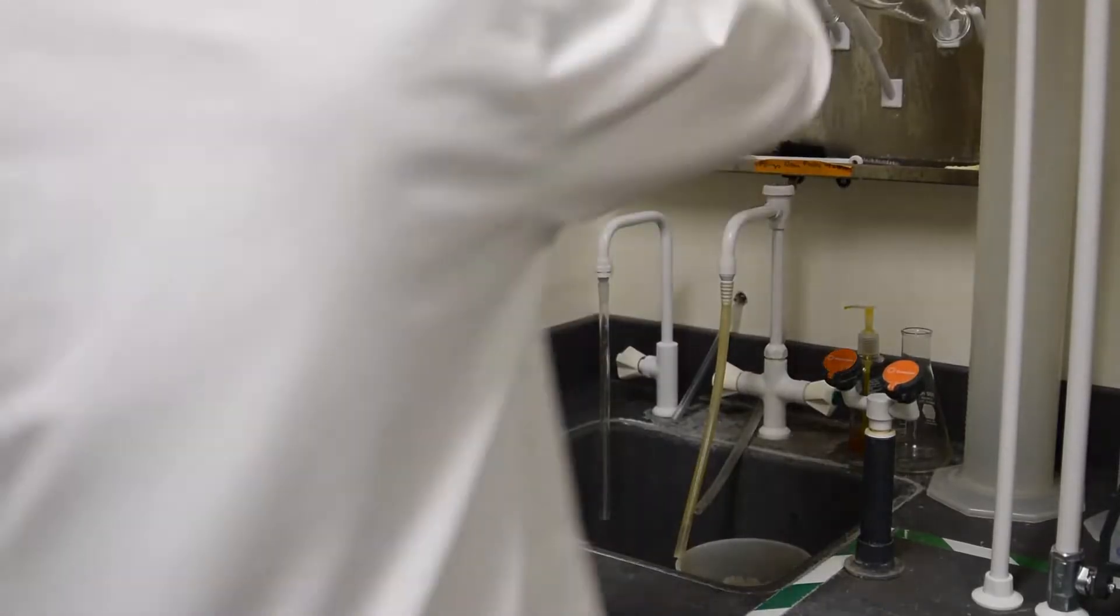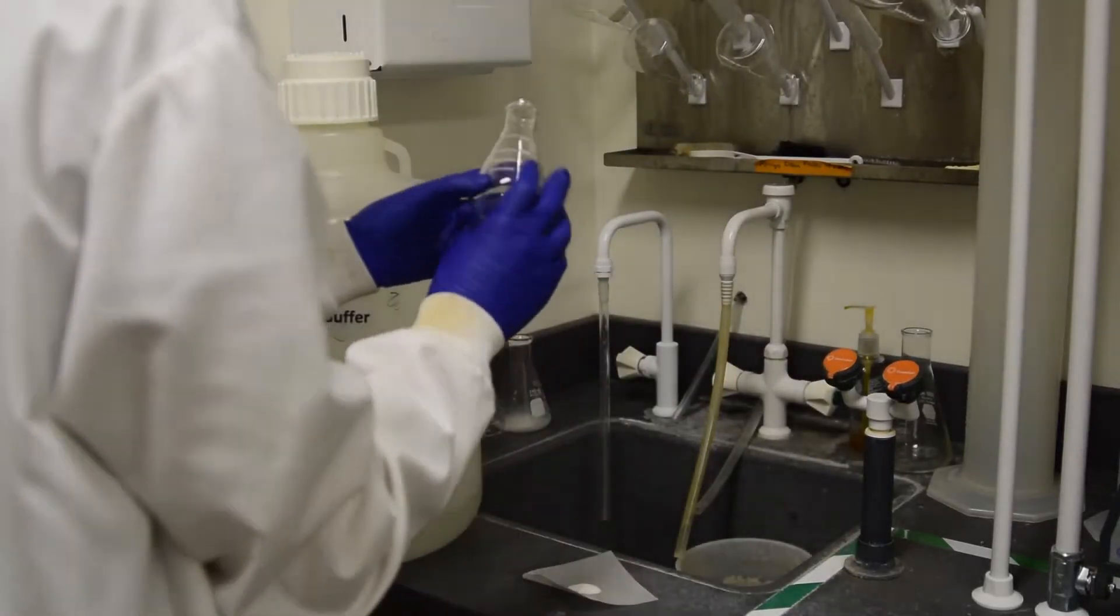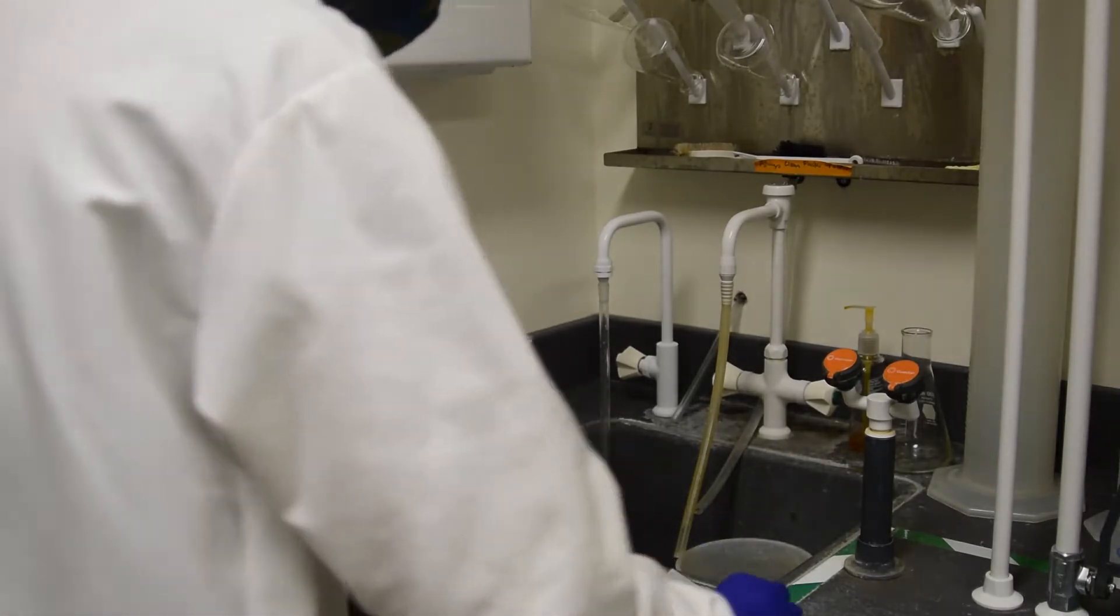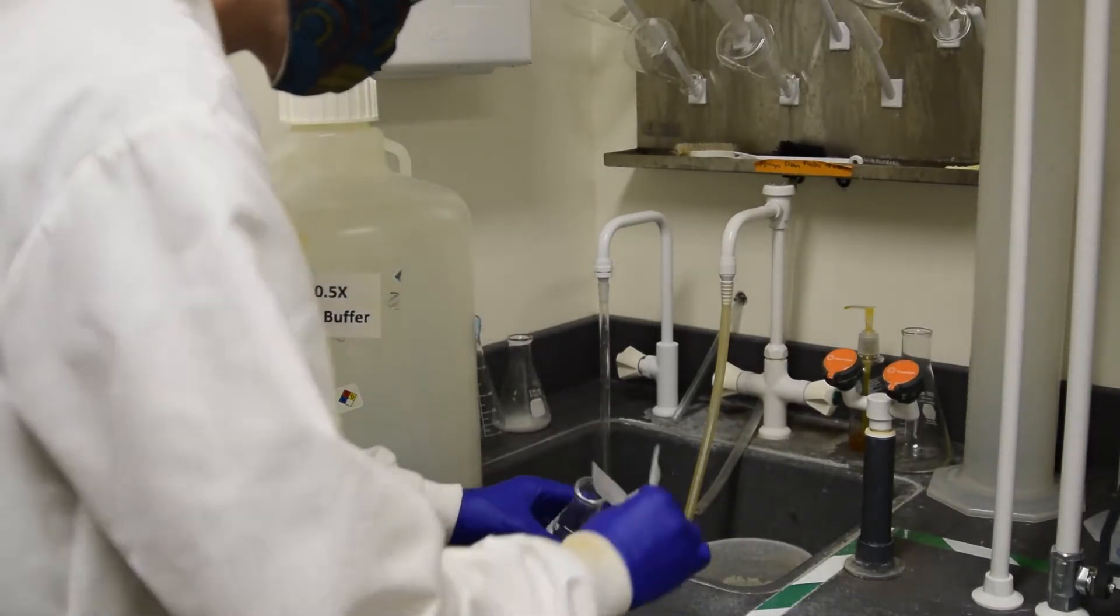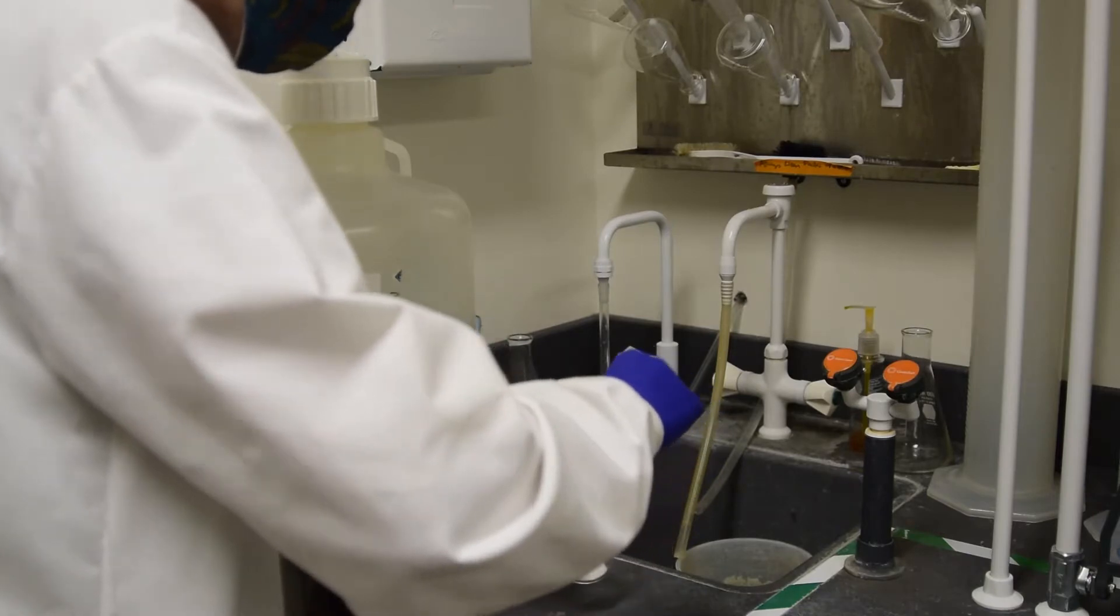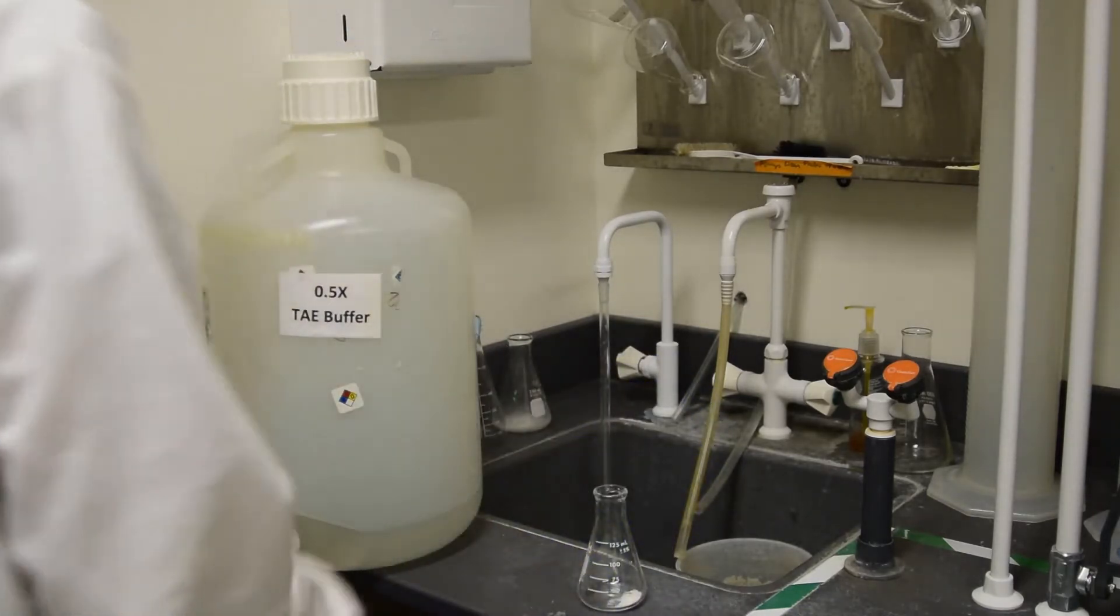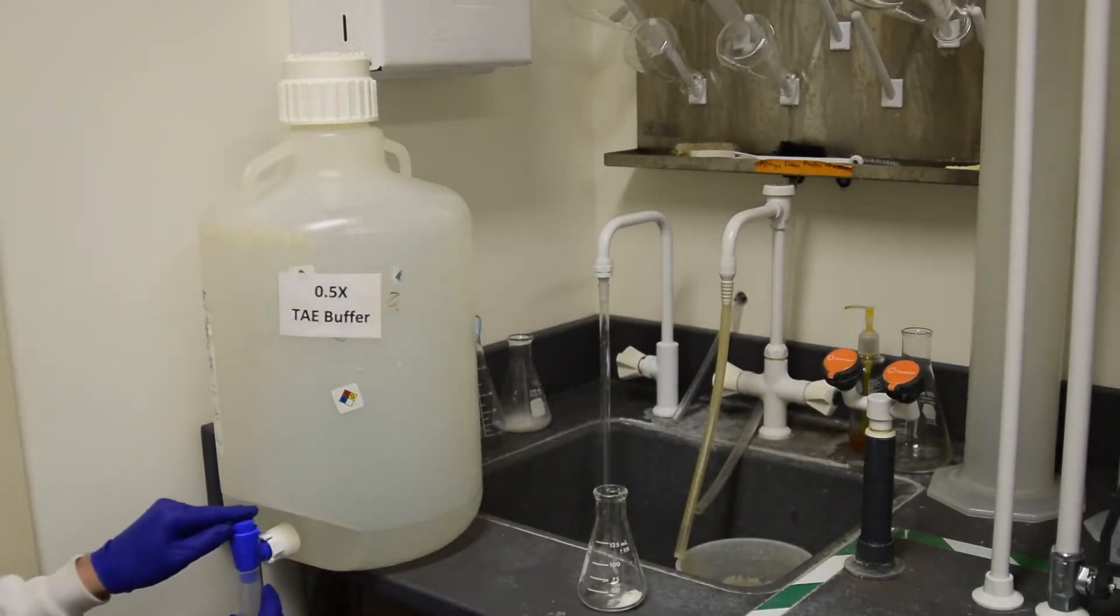Add the agarose to an appropriately sized flask, then add TAE to the necessary volume. The graduated cylinders above the sink do not have to be washed after measuring TAE.